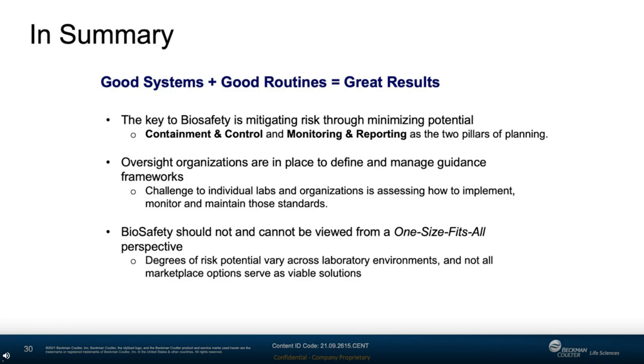Safety is the result, as we've heard here today, of well-designed and maintained tools such as centrifuges, combined with good practice to reduce risk. Oversight bodies provide guidance, but it is the responsibility of the organization to implement, monitor, and maintain safety standards. For this reason, safety is not applied universally, but is a practice customized for each organization.